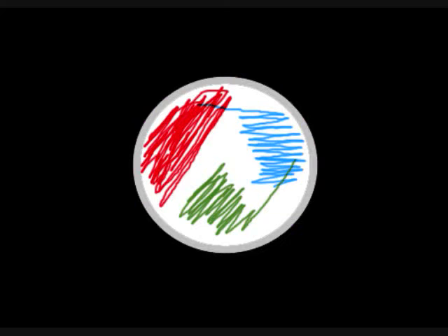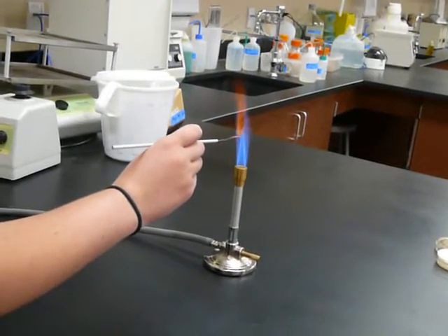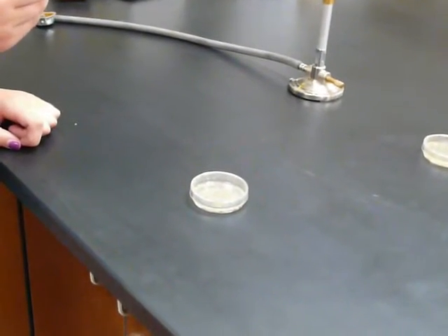When streaking to isolate bacteria, you will make three separate passes with your loop. The streaking pattern goes as follows. Remember to flame the loop in between each streak. Flame the loop and wait a few seconds for it to cool.